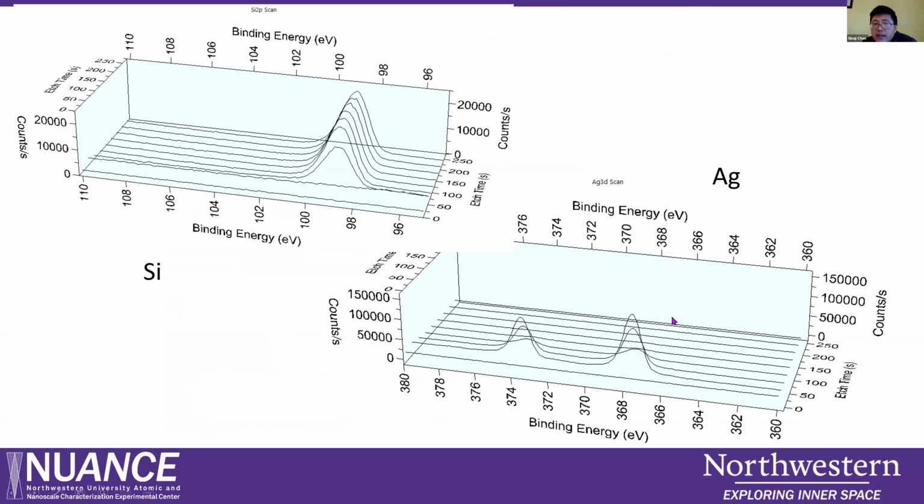So this is one example, silver on a silicon surface. You see here is silver. This axis is the energy, and this is the time. In these spectra, on the top layer, in the first etch cycles, there is silver, and then the silver is gone. On the top layer, because silver is covering, there is no silicon. And after this, the silicon shows up. So you use a 3D view to show this depth profile and how the spectra change. This is very cool.